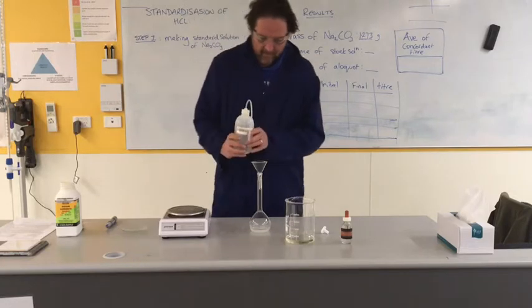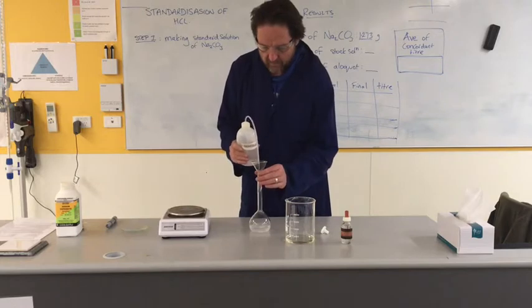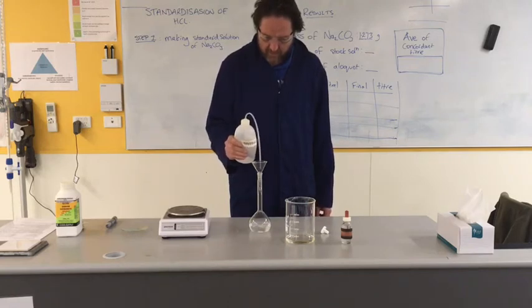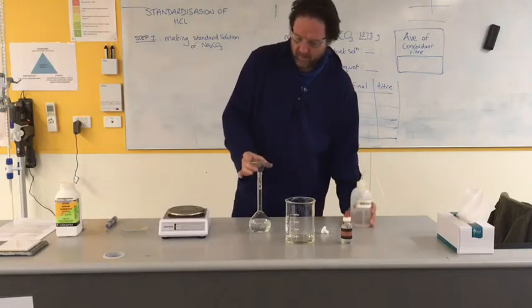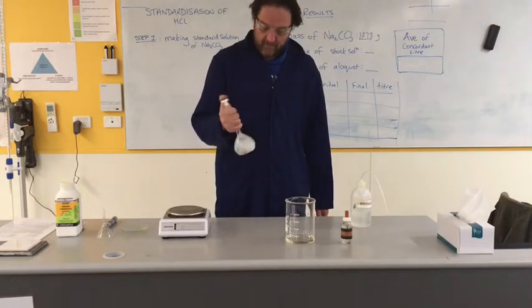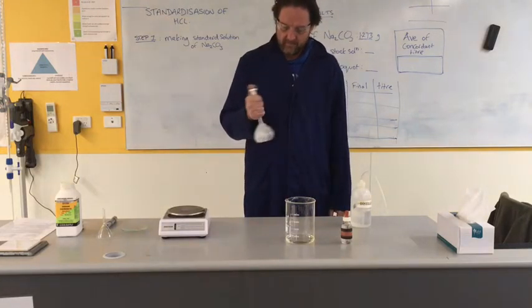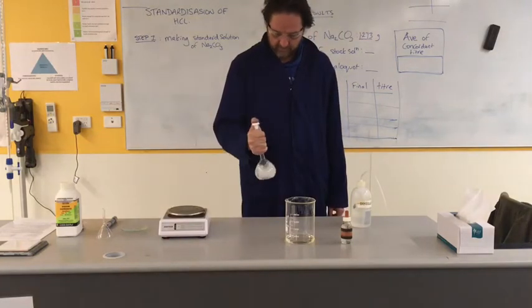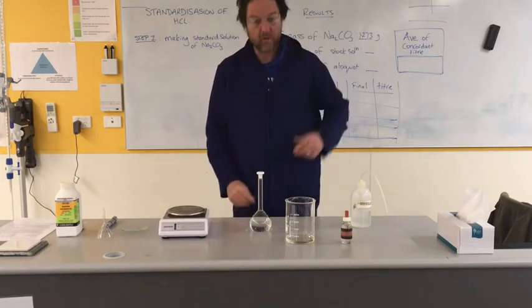I'm happy that that's clean. There's a little bit still in the funnel here - one little bit refuses to go. I'm happy the funnel is completely clean. What I want to do now is fill this up to about halfway up the bulb - it's already kind of there. Now I'm going to shake it until I can dissolve most of the sodium carbonate, then fill it right up to that mark. Shake it all around. That looks pretty good - a couple of little solids there, but we're going to be waiting a bit so I'm sure they'll dissolve.